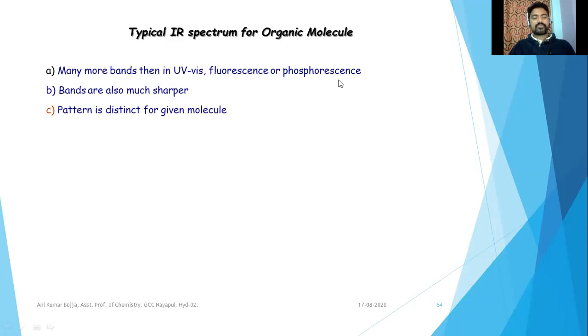Because of this peculiar quality, this important property, we are able to record the spectra for every molecule, and every molecule will have a different spectral pattern.